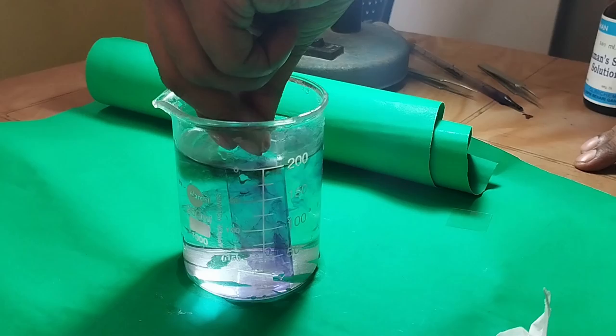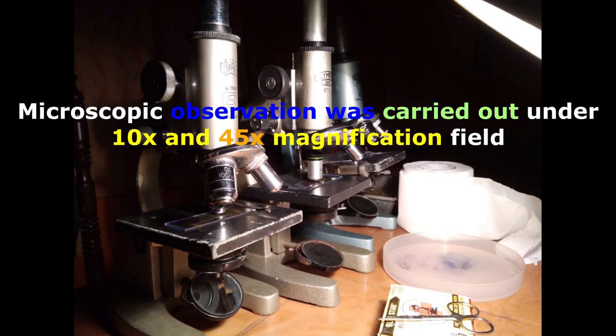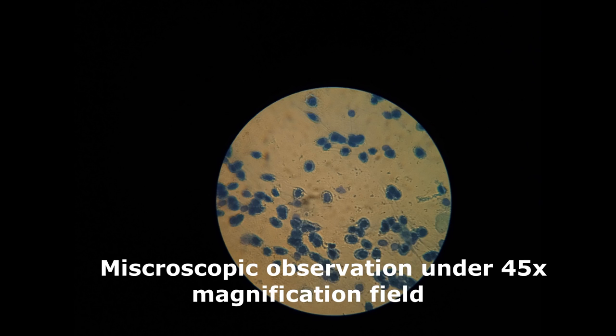Let the slide air dry before microscopic observation. We carried out observation under 10x and 45x magnification fields. Here comes some views of microscopic observation under 45x magnification.